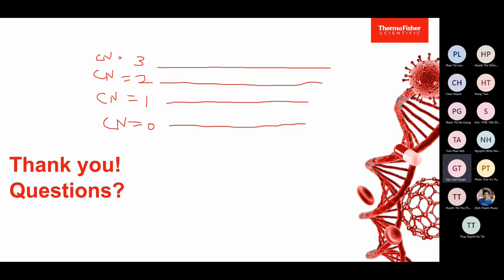When we do the hybridization, we have fragments, and we hybridize on the probes, and all of those fragments hybridize on the probes, and it gives a signal like 20,000. And in case of abnormal, it's 3 copy. If we do the same fragmentation and the same hybridization on the same number of probes, how can we know that it's higher intensity?